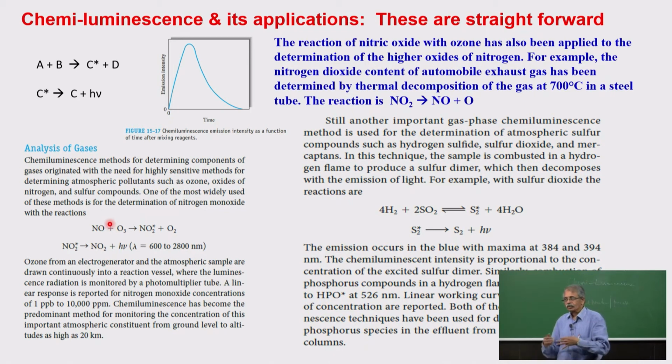Not only oxides of nitrogen and ozone, you can also use the oxides of sulfur, for example sulfur dioxide, which is present in the air. That is one of the things that people look at.